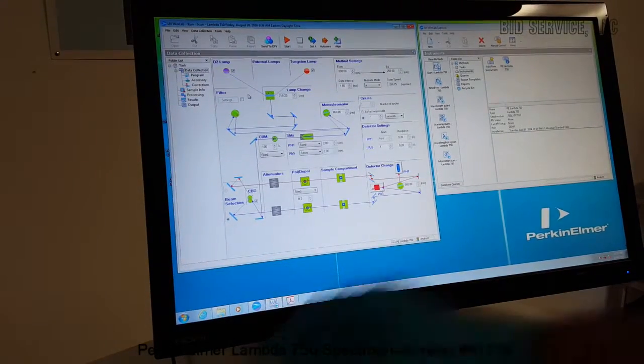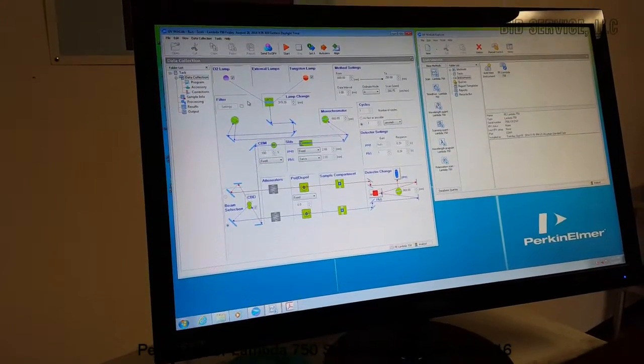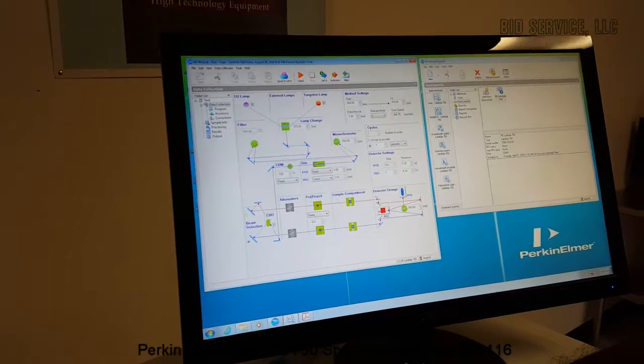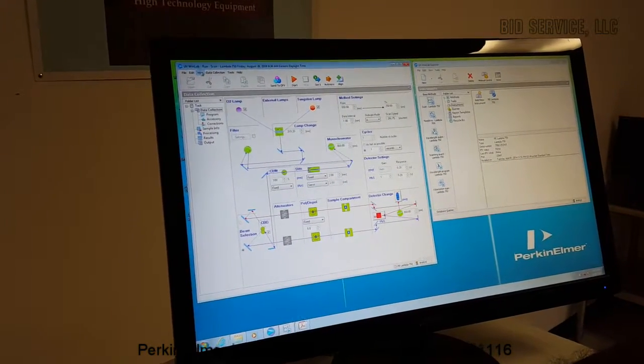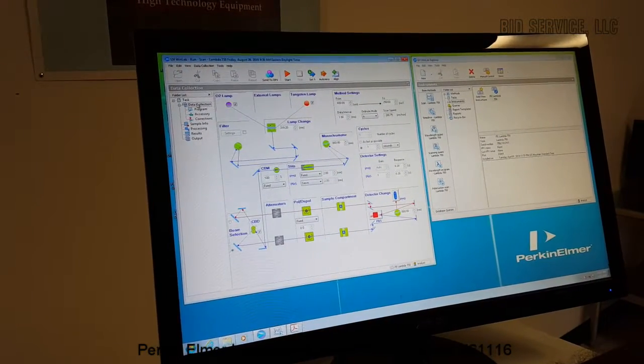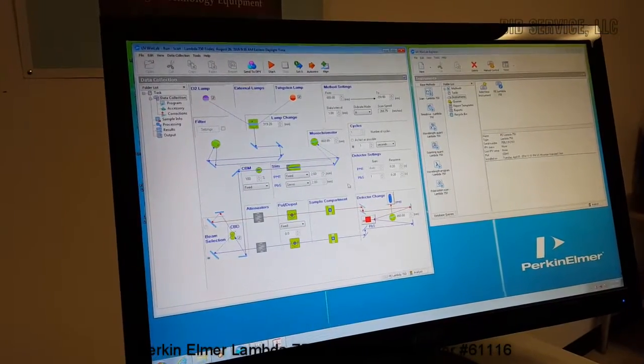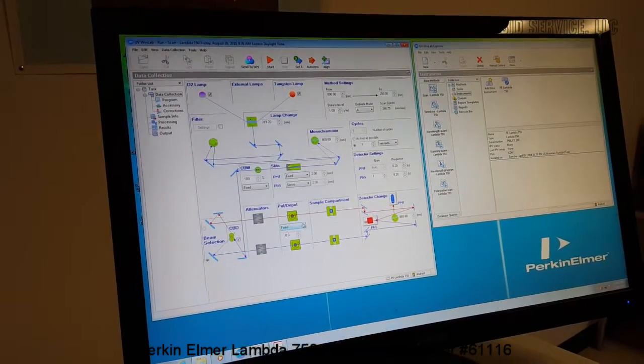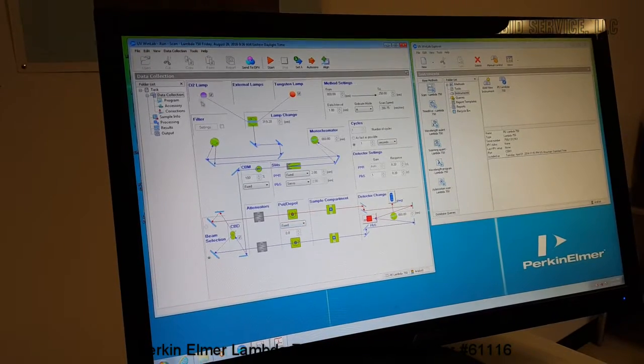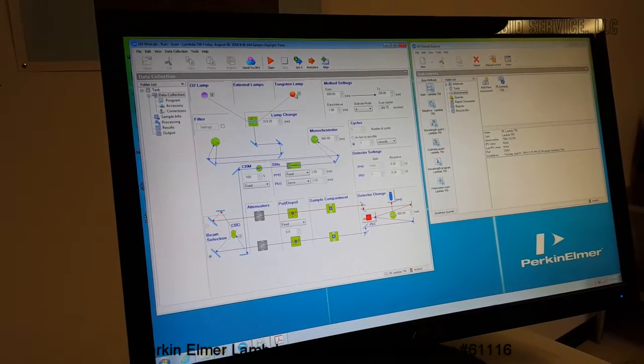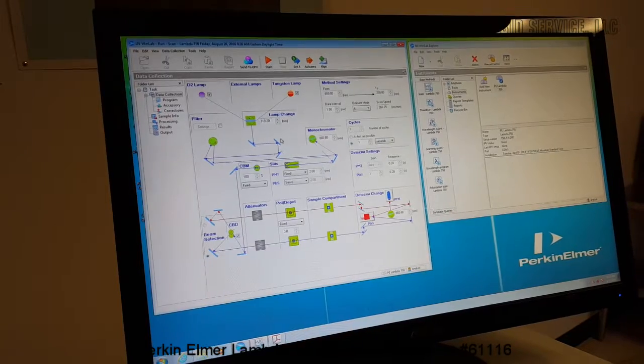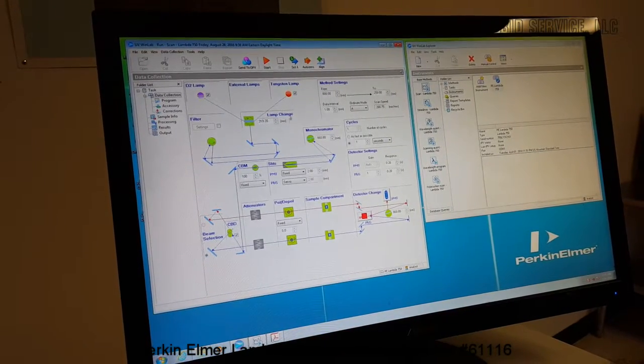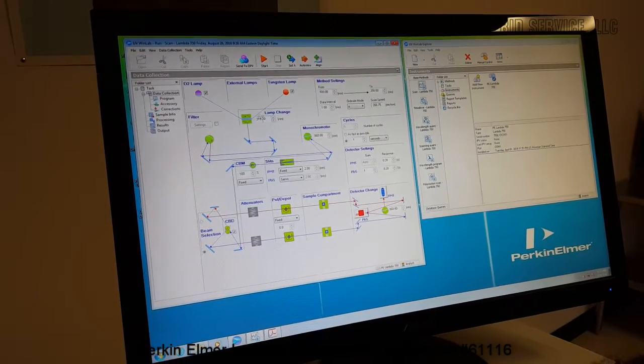So the software enables to run the system and we can set up the data collection modes here. There is a deuterium lamp in the machine and a tungsten halogen lamp. And depending on the wavelength selected, the lamp selection will change.